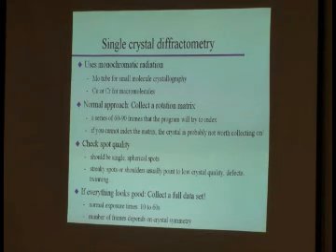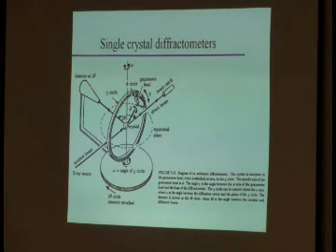A couple more words about the single crystal diffraction setup. Nowadays, the modern one. That was a modern diffractometer, okay? Well, actually no, not quite, because this detector would be a point detector. If you have an area detector here, that would be what a modern diffractometer looks like.